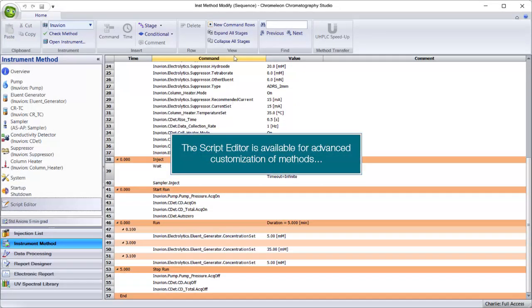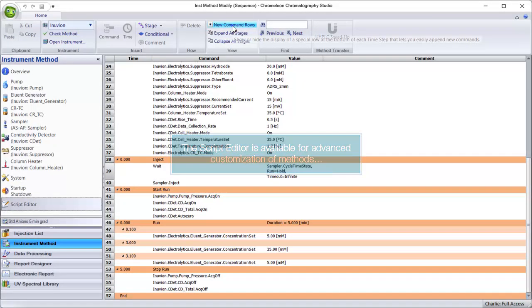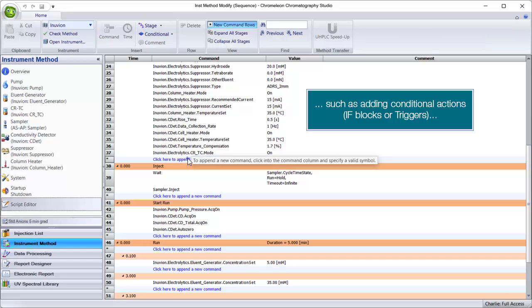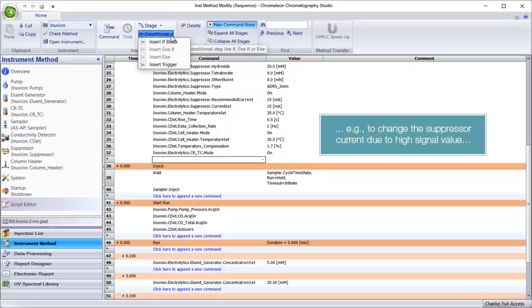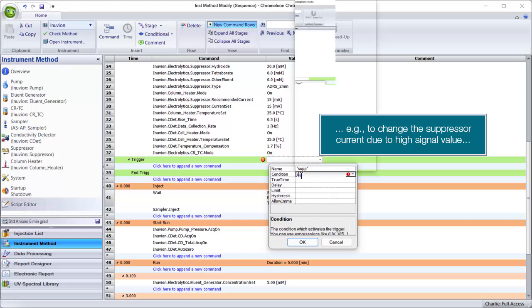The Script Editor is available for advanced customization of methods, such as adding conditional actions, if blocks, or triggers. For example, to change the suppressor current due to high signal value.